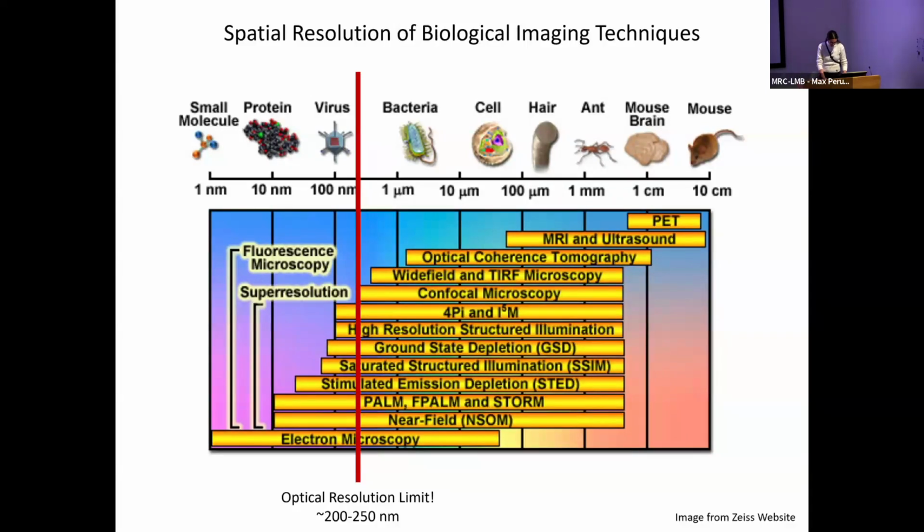And today I will present three main super resolution techniques: structured illumination microscopy, or SIM, stimulated emission depletion, or STED, and single molecule localization microscopy techniques, or STORM. Those are three techniques that we have available in light microscopy, and they go beyond that diffraction limit.